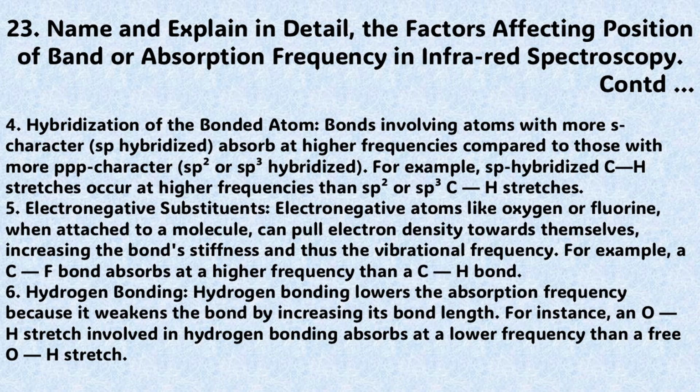Hydrogen bonding: hydrogen bonding lowers the absorption frequency because it weakens the bond by increasing its bond length. For instance, an O-H bond stretching involved in hydrogen bonding absorbs at a lower frequency than a free O-H bond stretching.